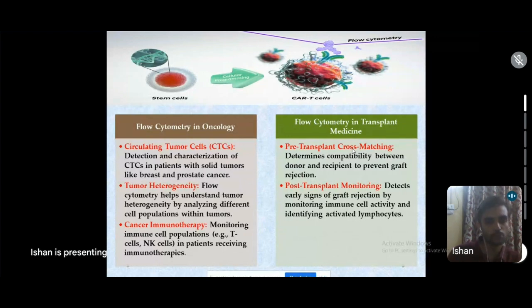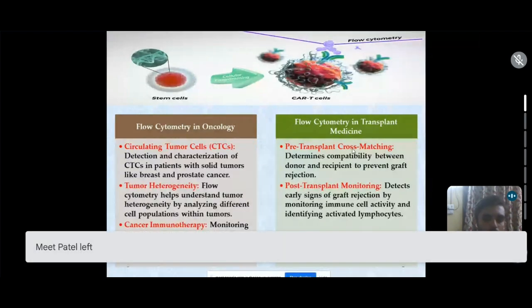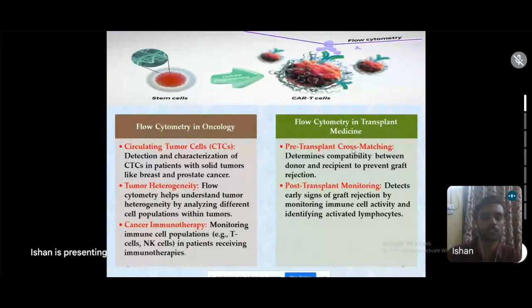So sometimes we monitor the immune cell population, for example the T cells, the CD8 T cells. Cancer immunotherapy is also being seen in the development of cancer vaccines. The vaccines developed for infectious diseases are also being developed for cancers. In cancer immunotherapy, the global biotechnology industry is looking at developing cancer vaccines too, in the form of immunotherapies or monoclonal antibodies, the MABs.